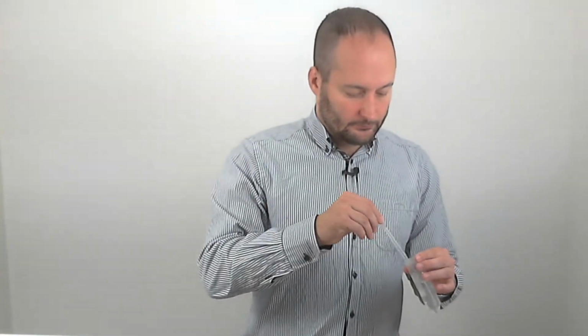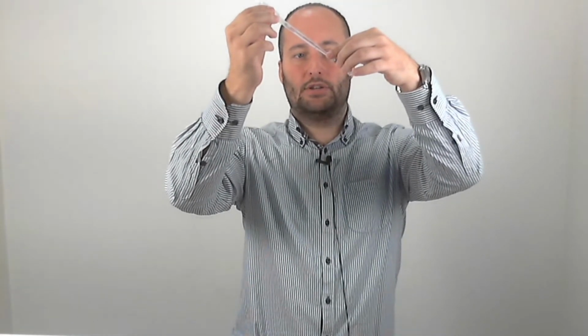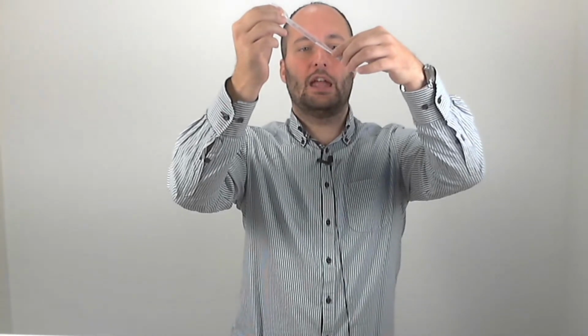Okay, thank you. Good. So I will quickly repeat the experiment here with 10% sucrose in water. And once again, I will take the filter pointing down and angle it. Two seconds, sorry for that. I will angle it down again, and then I will pipette it so the liquid runs over the crystal and lifts off any bubbles. So when I turn it back, I will have no bubbles within the view of the crystal itself.